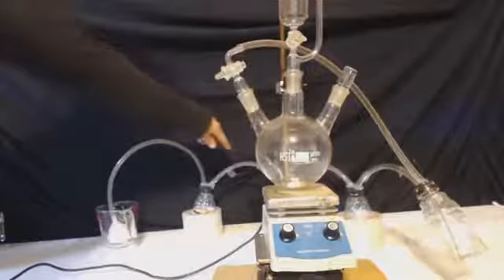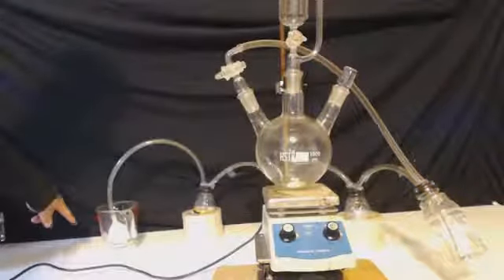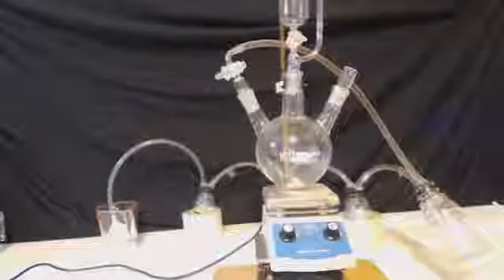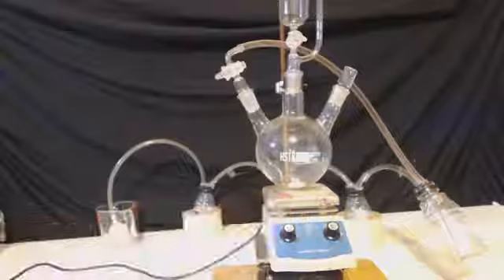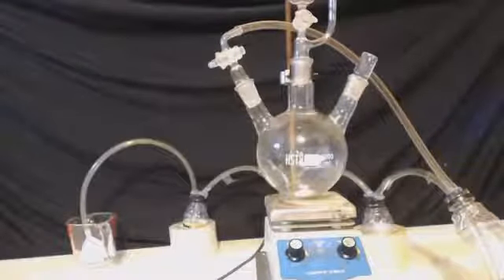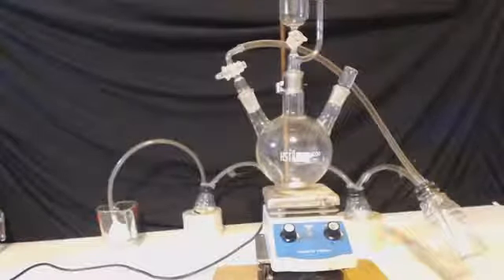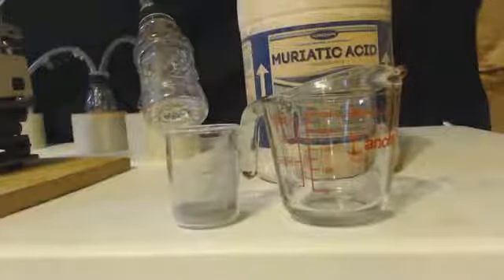It leads through all those bottles, which have sodium hydroxide in two of them, and right there where the funnel's at, I have water. So any HCl gas that escapes, or the hydrogen I'm going to make, will go through those bottles and scrub out that HCl, so I won't have to breathe it. You can see I've got my stir plate, my stir bar inside there, and basically I'm going to put the HCl up top and drip it in.